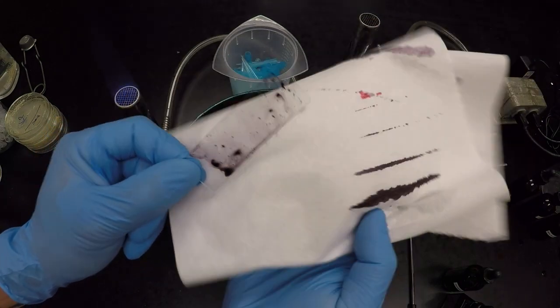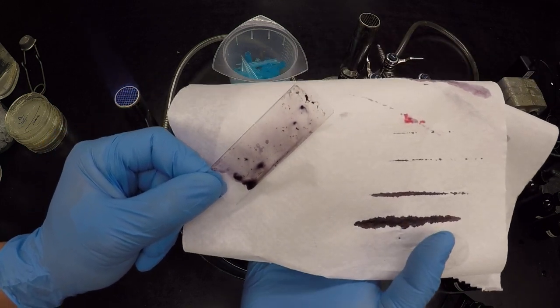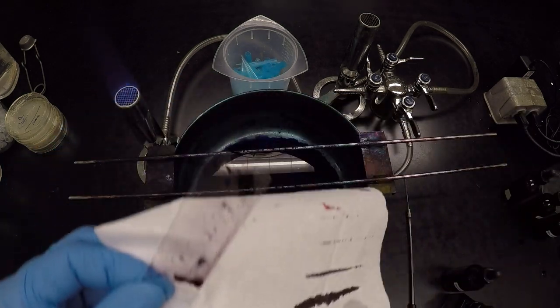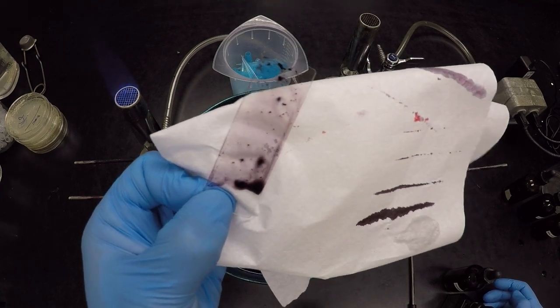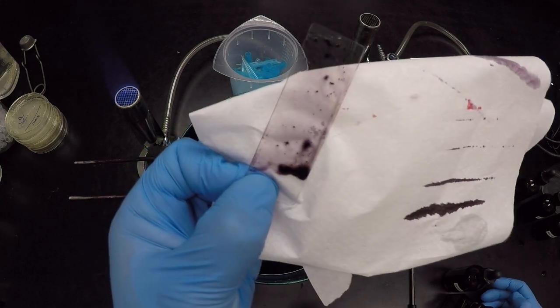What you want to start looking for is a black field, and within those black fields, look for halos with red cell-like objects in them. Okay. The capsule stain is kind of a challenging stain just because of the fact that things aren't fixed. Things often run off. So our success rate isn't great, but try it out and see what happens for you.